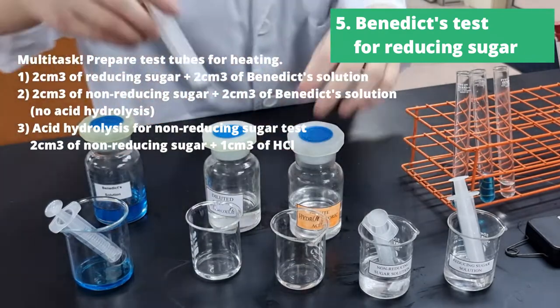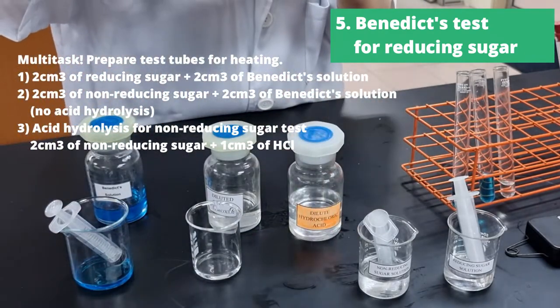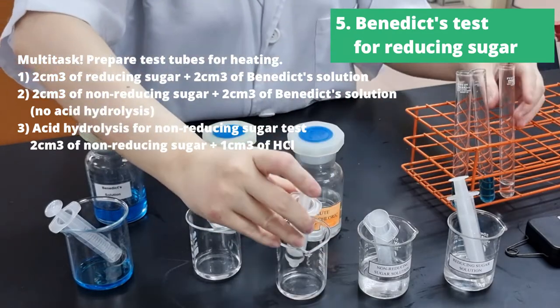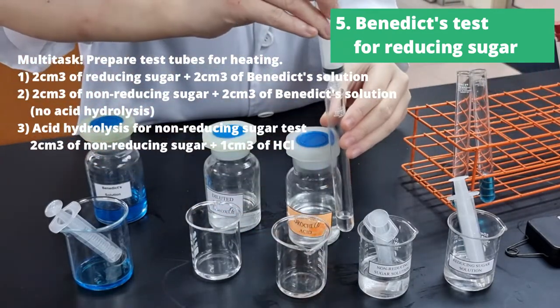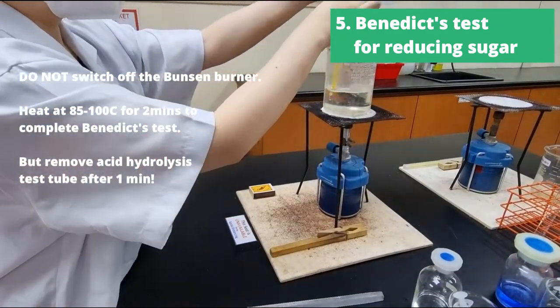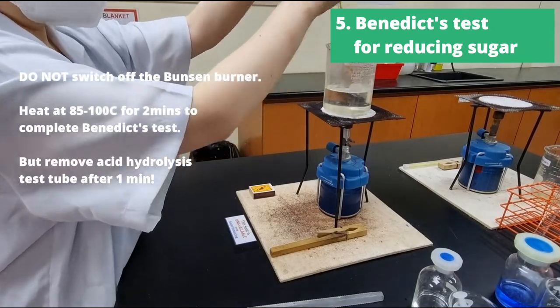Now the third test tube will be the acid hydrolysis tube. For this, we will add 1cm³ of hydrochloric acid to 2cm³ of non-reducing sugar. Now we can take these three different test tubes and put them into the water bath.